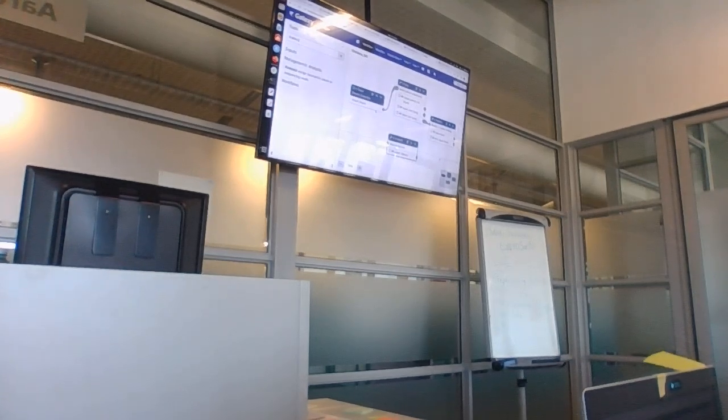Oh, extract this script. You have to run... You could write maybe something in your workflow, positioned after the MultiQC, that says check the MultiQC file, find the data. I think she wanted to push this across, to the cloud.